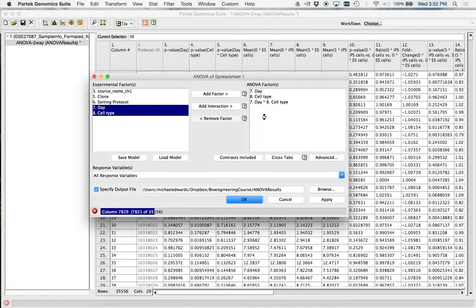If you annotated your gene list right, once it's done with its calculations, you should see a bunch of gene names come up. Come on. Yeah, it's only doing 36,000 t-tests.